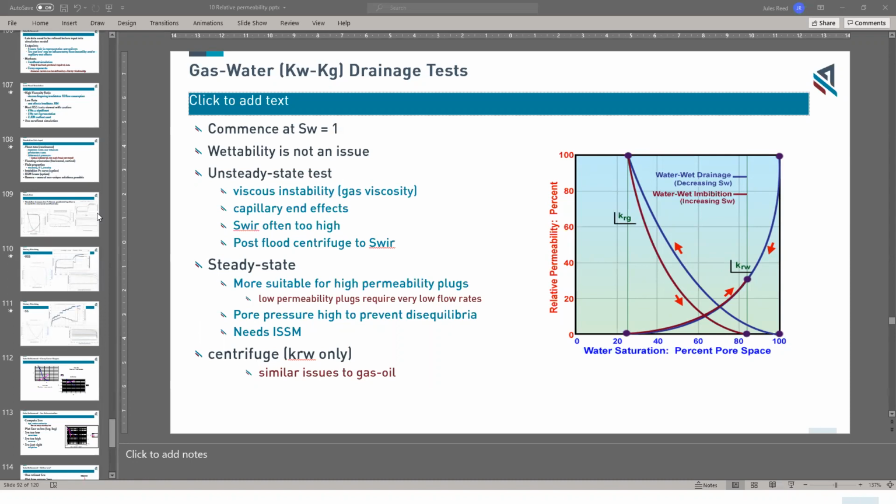In co-current injection, the production is in the same direction as the flow. So you'll be injecting water, maybe, or just allowing it to contact the sample and flow, and the sample will be in a core holder, and flow will always be in this direction or in this direction, depending on whether you're injecting water or injecting gas. So co-current injection is when you obtain effluents and production in the same direction as flow.